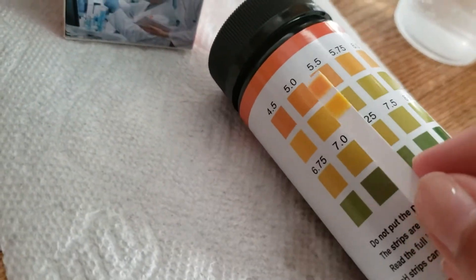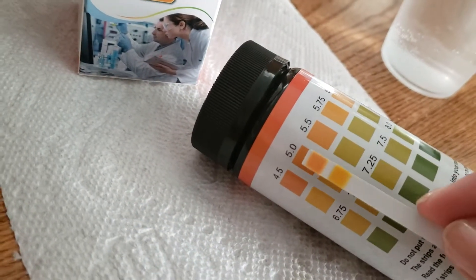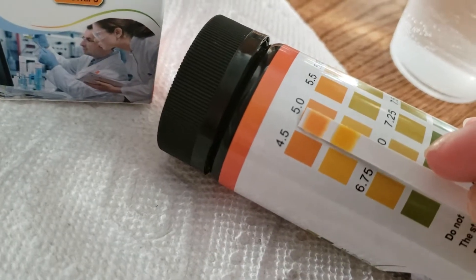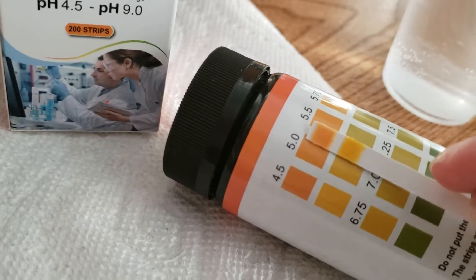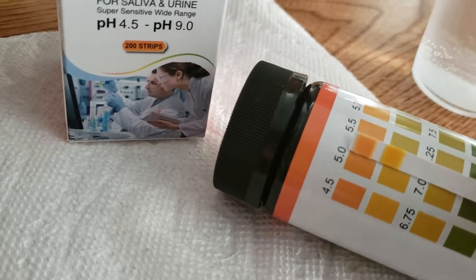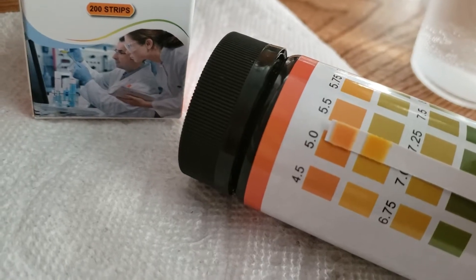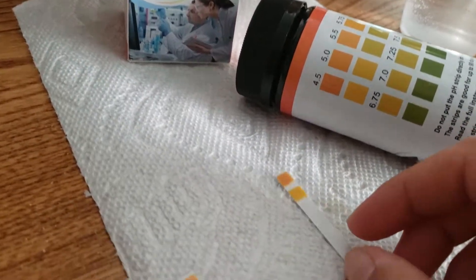Looking at the closest result, it looks like the lemon water is at a pH of about 4.5 or 5. I think it's slightly lighter than the 4.5, so I'm going to go with a pH of 5. A pH of 5 is acidic, which corresponds to the acidity of lemon water.